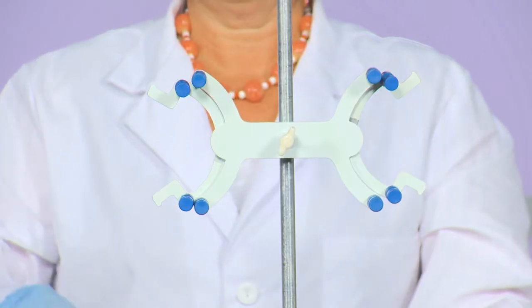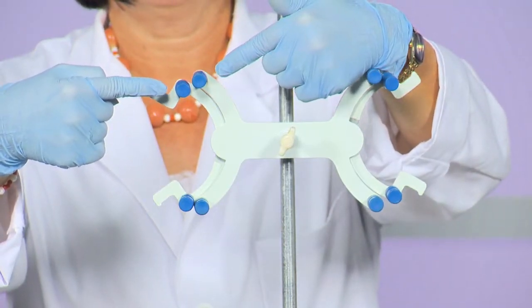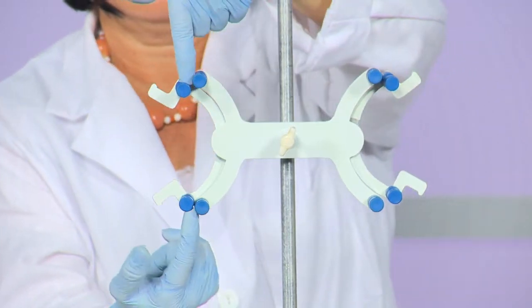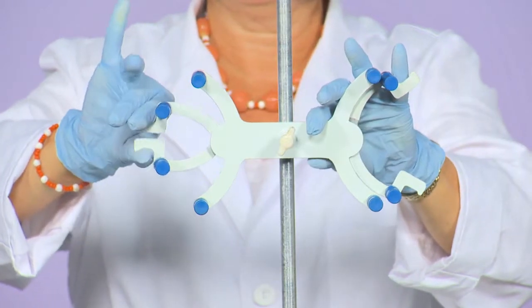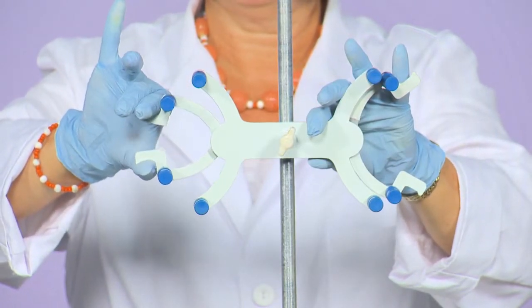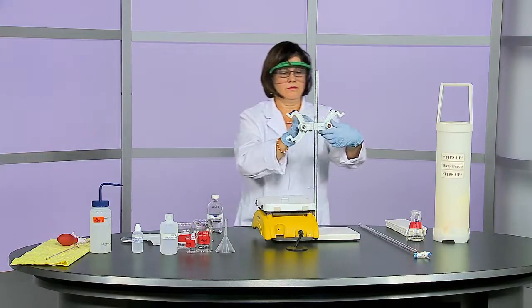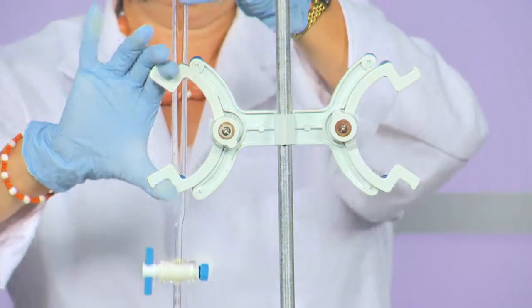Take a closer look at the burette clamp. Notice that the rubber knobs are indented. The burette will be securely in position when it is in between the indentations of the rubber knobs. Squeeze both arms at the same time to open the clamp. Place the burette in between both arms and gently release the arms. Inspect it to make sure it is properly in place and reposition it if necessary.